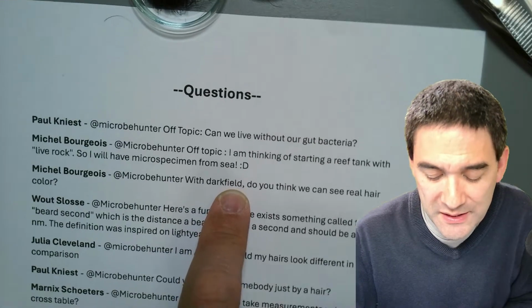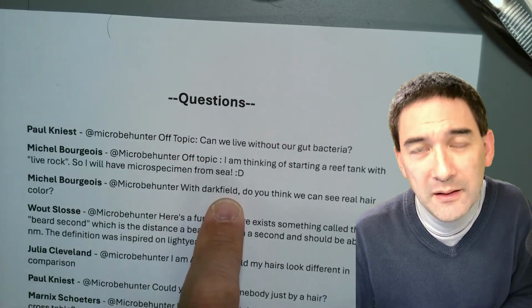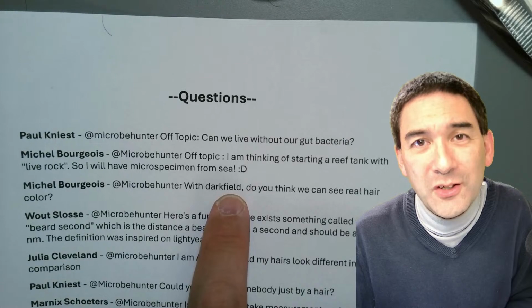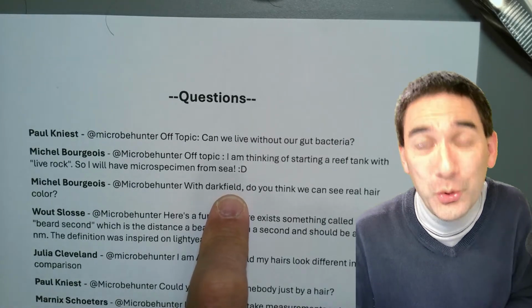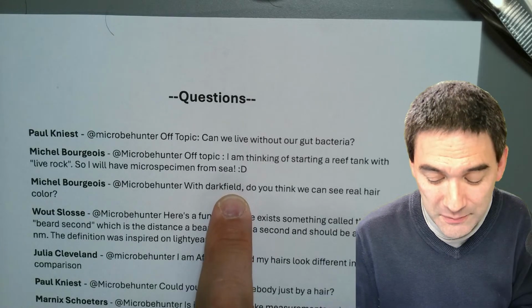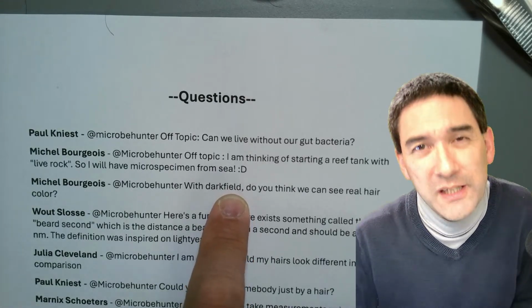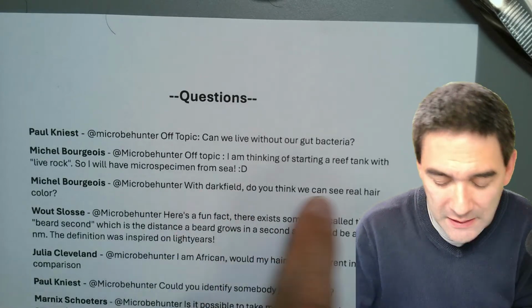Basically, generally, what I would say is that the point of dark field is to increase contrast, and therefore the colors are not real. You want to have a higher contrast than what you normally would be able to see. Right, so sometimes you deliberately do not want to have the real color simply in order to see it better.